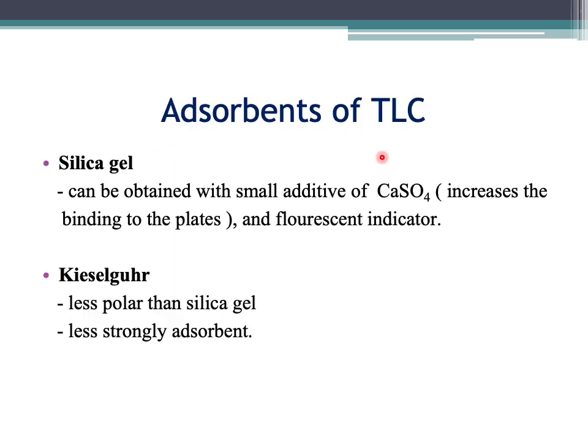Adsorbent of TLC. Okay, ni adsorbent yang digunakan dalam TLC tu. Ingat, TLC yang digunakan adalah solid adsorbent. So, ini adalah contoh-contoh adsorbent. For the first one is silica gel.